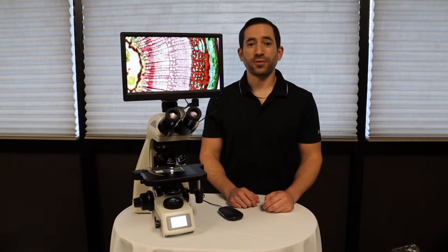The View 4K HD microscope camera brings 4K technology and resolution to the microscopy world. This camera can be mounted on any brand, maker, or model microscope, and offers three output methods.